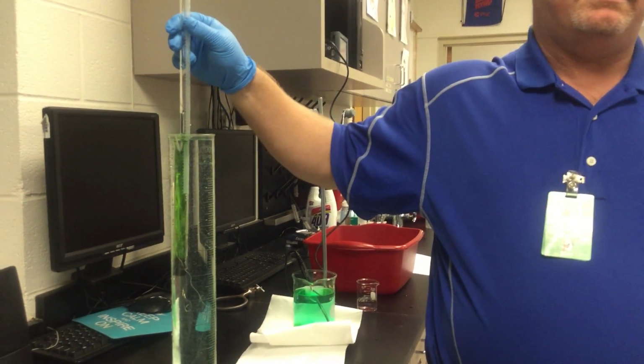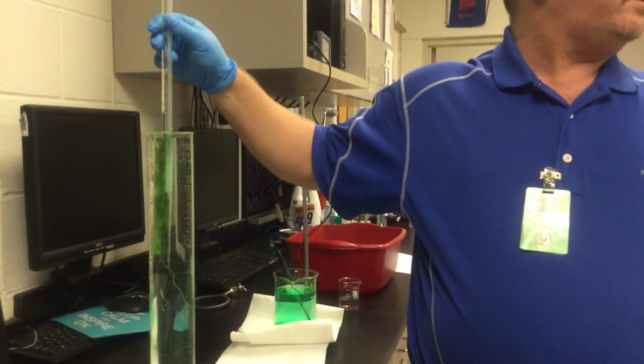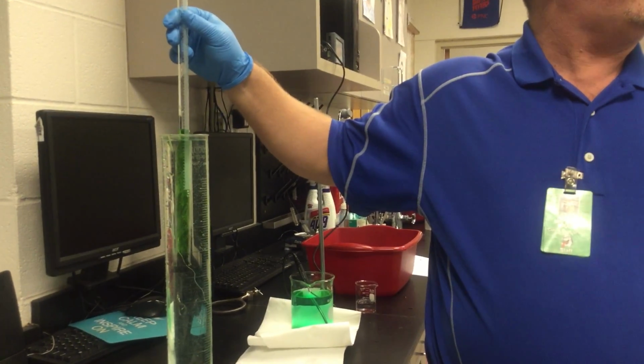Okay? I'm going to go ahead and have Kyle shut off the video, and I'm going to show you how to convert our pressure.